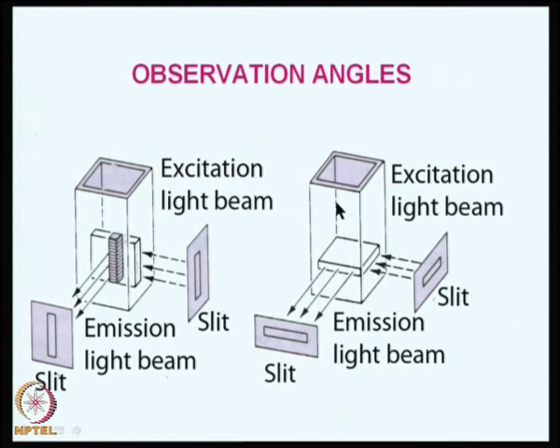This gives me a freedom to use a very small sample, as big as or as small as the slit width we are employing. This is the beauty of spectrofluorometry. That means solution volumes are not so important in spectrofluorescence measurements. What we need is the solid angle coming from the slit and the geometry of measurement. So, we can work with very, very small amounts, of the order of a few microliters, using spectrofluorimetry.